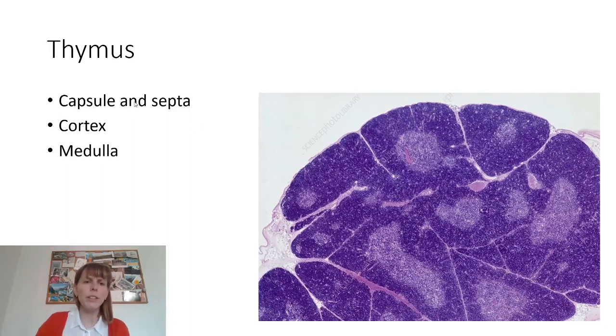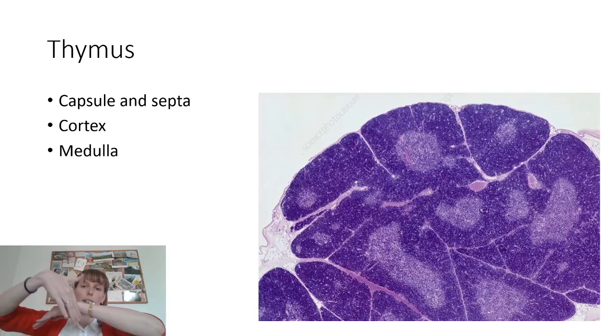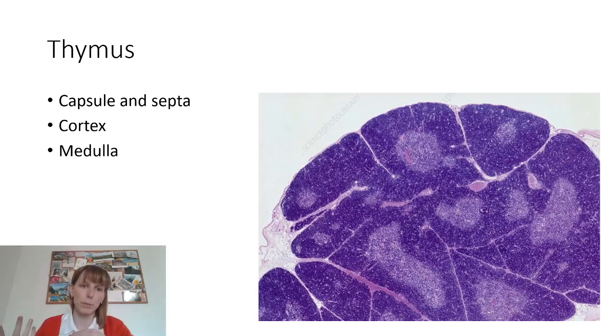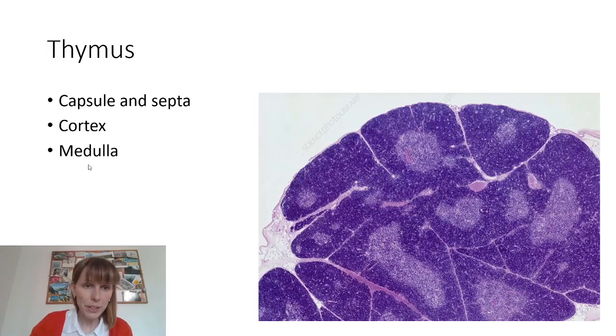the difference between trabecule and septum is that if you have the capsule and you have just a sort of tube or something going in, it's called trabecule. But if you have a sheath of connective tissue going around, like 3D, a long, thin piece of connective tissue, it is called a septum. So septa in thymus are longer, but trabecules are just one trabecule, second trabecule with the arteries inside them in the spleen. So that's the difference. It's still dense, irregular connective tissue.